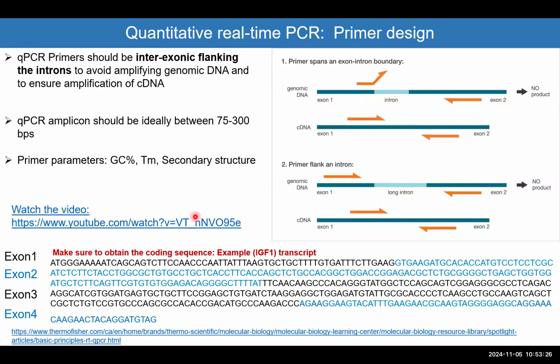Sounds good. So now we are moving to the second step. So we designed primers for the qPCR. And if you use Primer3, it gives you suggestions. All you need to do is just take those and test them.